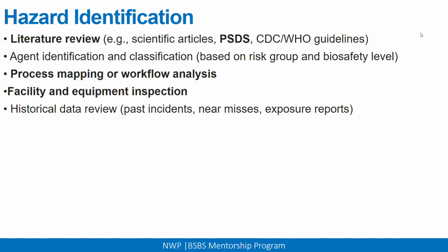Therefore, your likelihood ratings, as you start determining your likelihoods, will be high. So you need to review your records for your incidences.